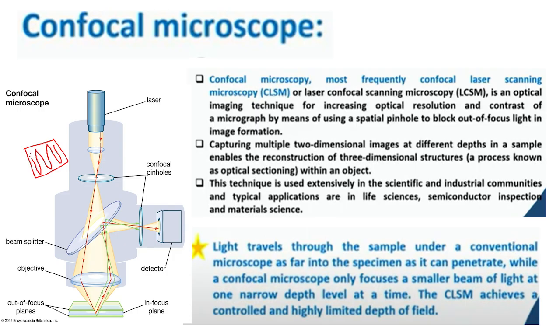There are very small points here, and after interacting with each and every point, I'm getting back the signal, and after that I make an arrangement through the software and prepare the image. So in that way, the confocal microscope will give you a more intricate structure of any object.